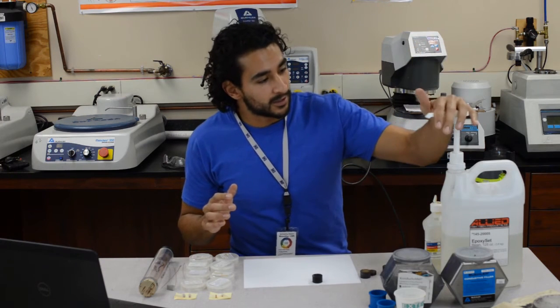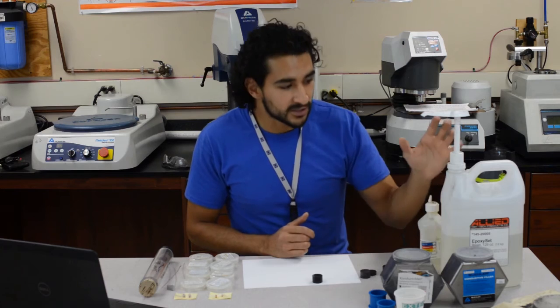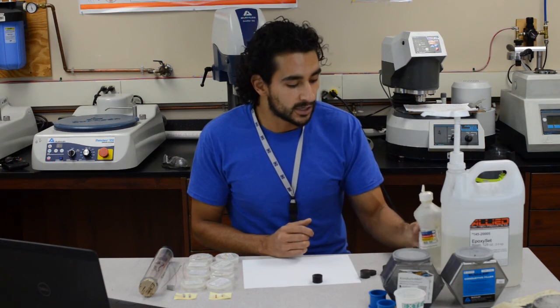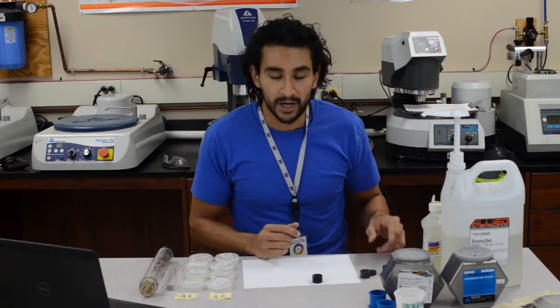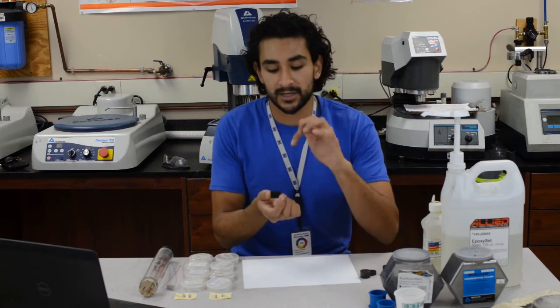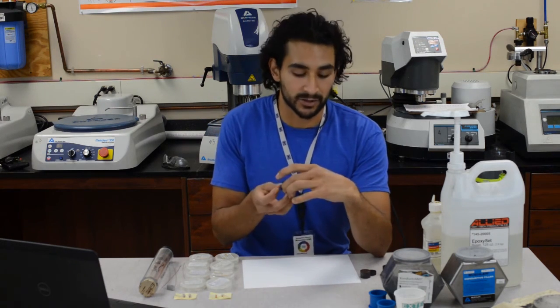And then we have the epoxies — we also use epoxies a lot here. These don't require high temperatures and pressures, so they're very useful when you can't afford your sample getting too hot or going under too much pressure. The one downside about the epoxies, though, is that they're not electrically conductive, and sometimes you do want your puck to be electrically conductive, especially if you're taking pictures under the scanning electron microscope.